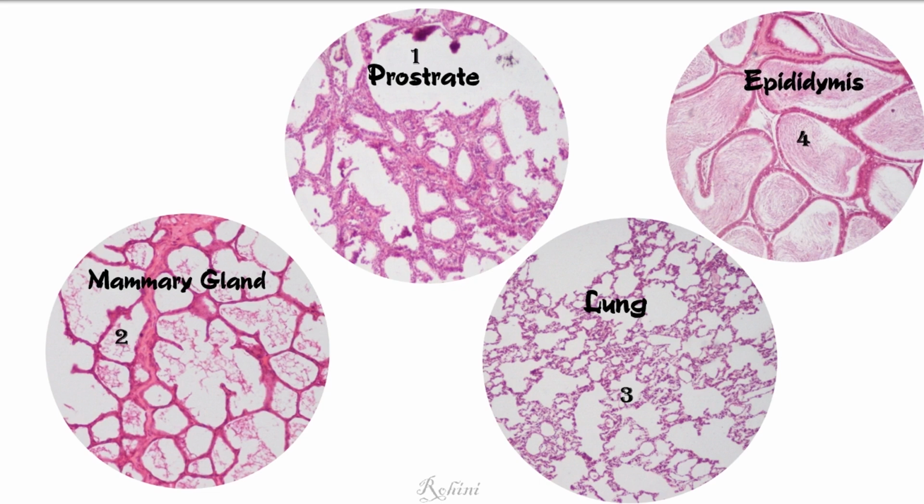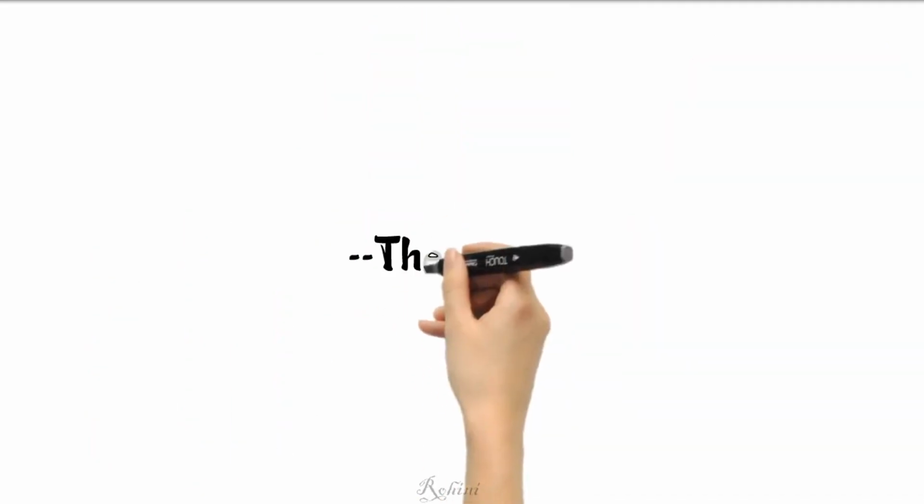Hope this video has helped you differentiate the frequently mistaken slides. Hope this helped you.